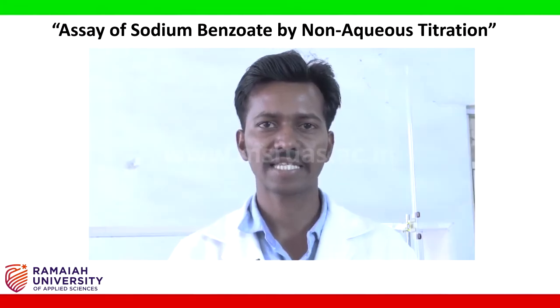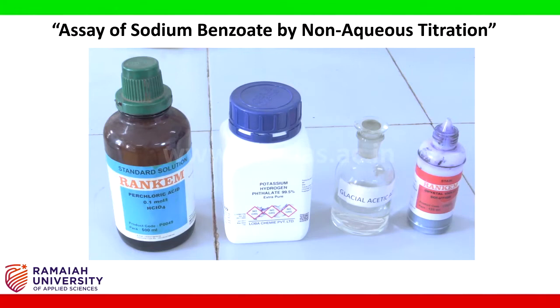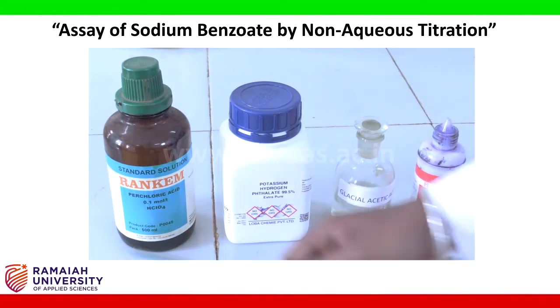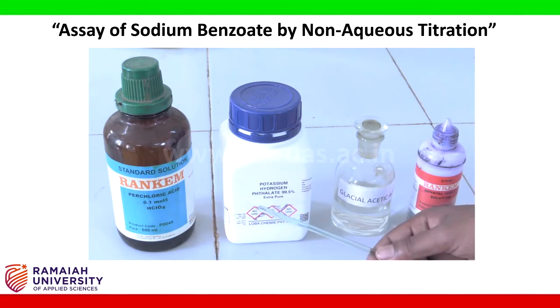As the experiment has two parts, one is standardization of perchloric acid and another one is assay of sodium benzoate. Now let's start with the standardization of perchloric acid. For the standardization of perchloric acid, we are using the following chemicals: secondary standard perchloric acid solution, potassium hydrogen phthalate, glacial acetic acid and crystal violet indicator.